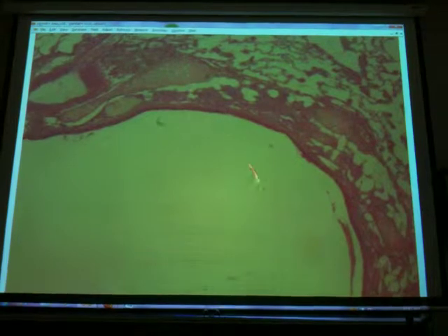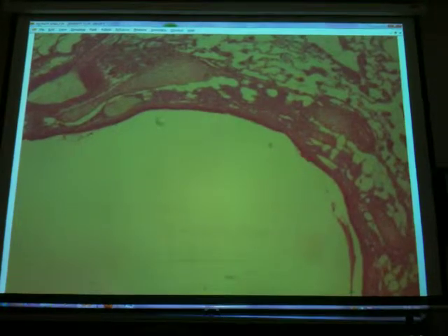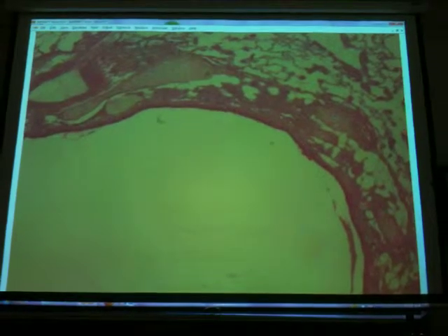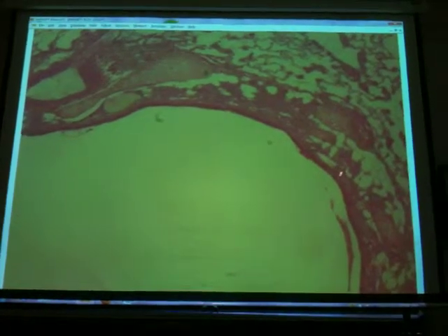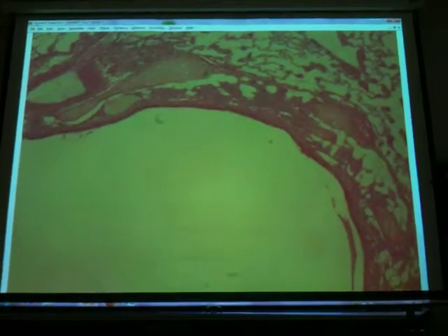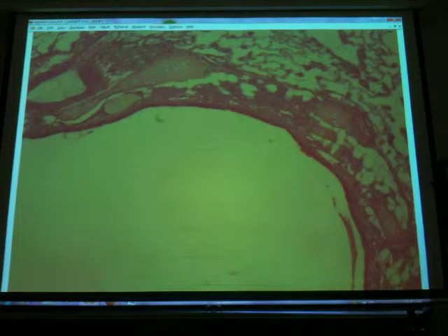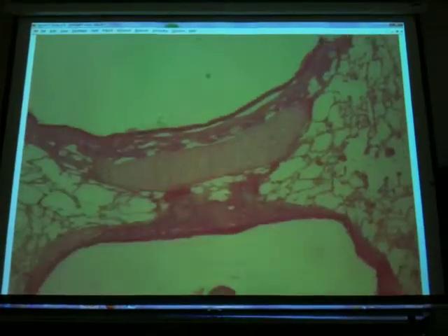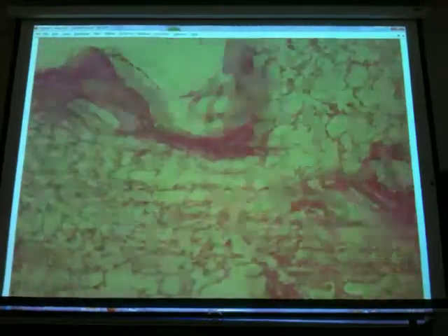Okay? So what do we call this particular structure? A bronchus, right? And we can look and name the PSCCE. We can look and name the smooth muscle. We can look and name the hyaline cartilage. And sometimes along the edge of a bronchus, we actually see lymph nodules. I don't know if it's on this one or on the other slide.